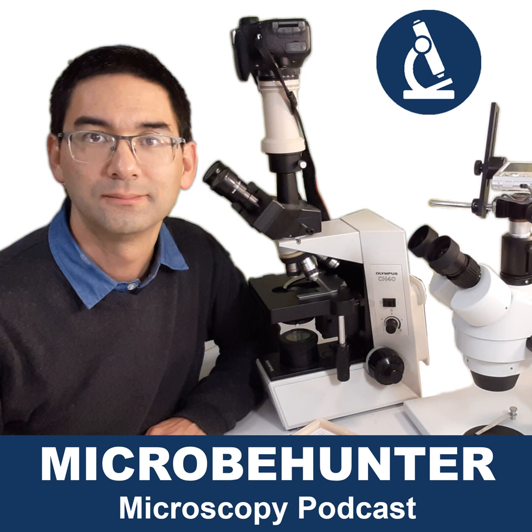So many microscopic specimens are transparent. And if you look at a transparent object in water, because in many cases the specimens are in water or in a mounting medium, then you're not able to see very well because the color contrast is too low. And especially a very small object, even if it is pigmented, because it is so small, the effect of the pigment, the effect of the color, sometimes is not very visible.